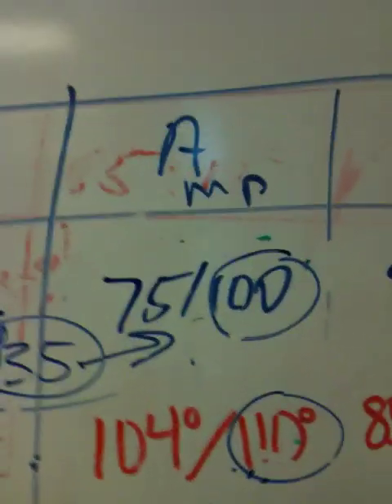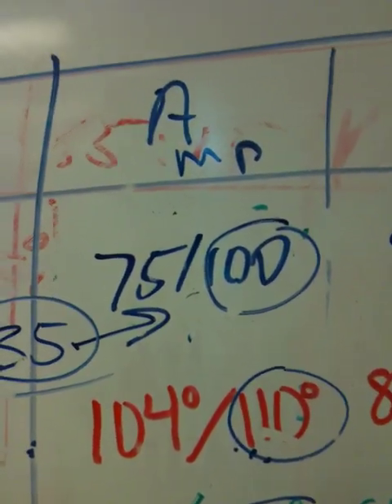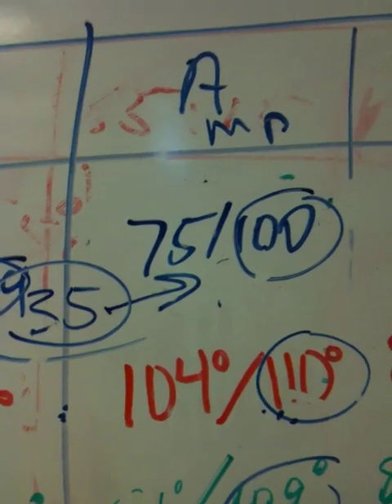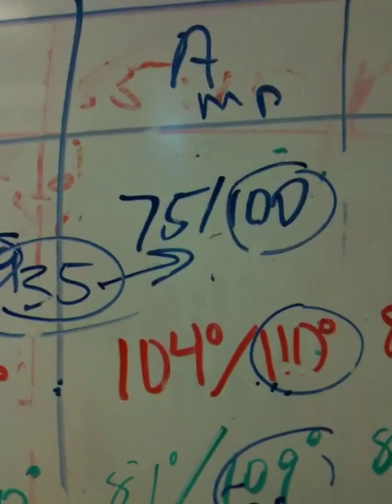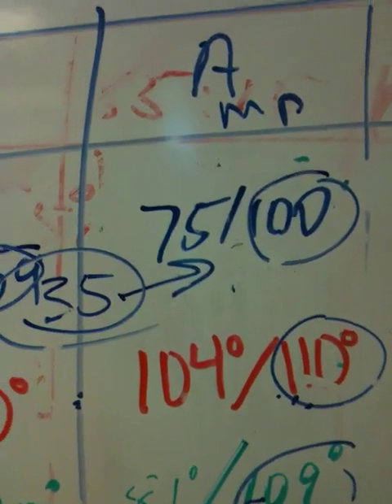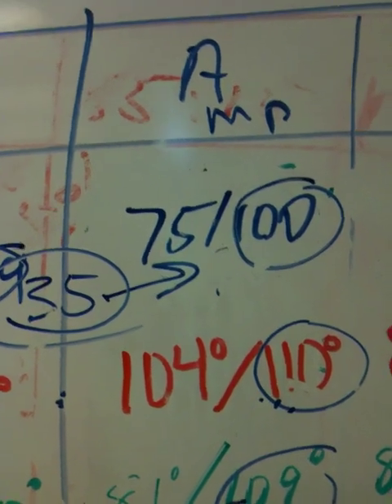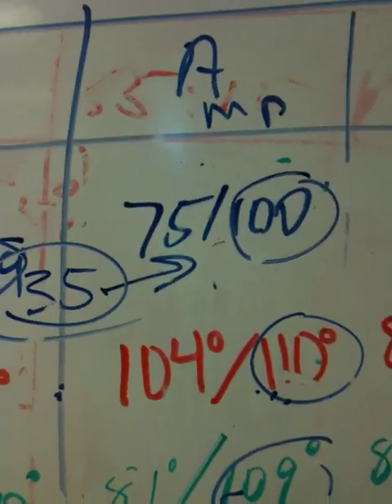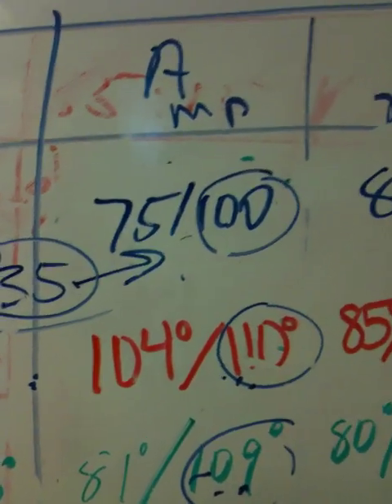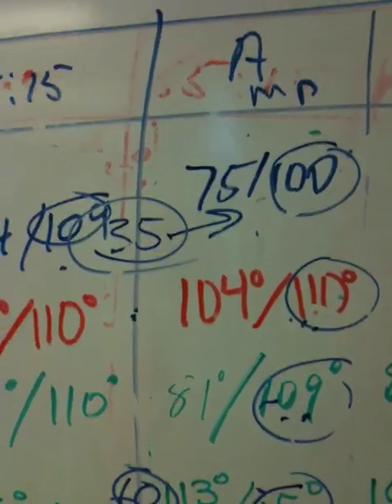Okay? And the reason we would expect this is we would expect the A sample to be purer than the B sample, because for most people, the A sample was cooled slowly to room temperature. What this allows is a slow growth of crystals, equilibrium conditions in which the crystal, if it does pick up a salicylic acid molecule, will have the time to exchange that salicylic acid molecule for an acetanilide molecule, which would presumably have stronger interactions in the crystal and be less easily exchanged. So eventually the crystal would have great integrity and be built in a very regular fashion with the same type of molecule, leading to a much stronger lattice energy.